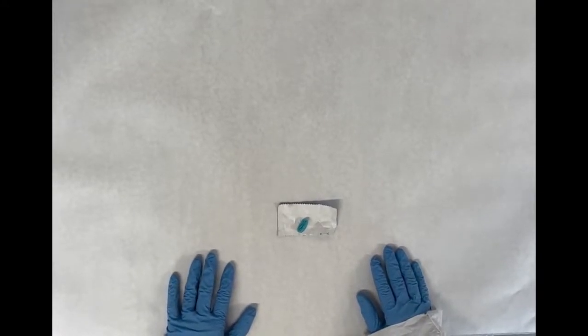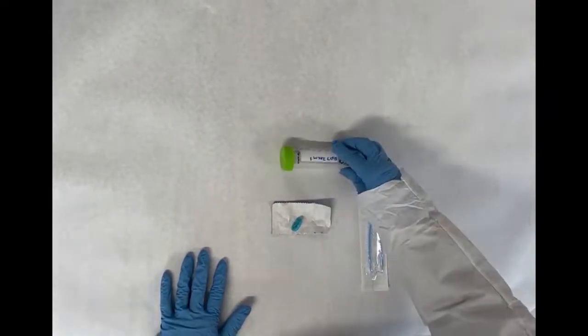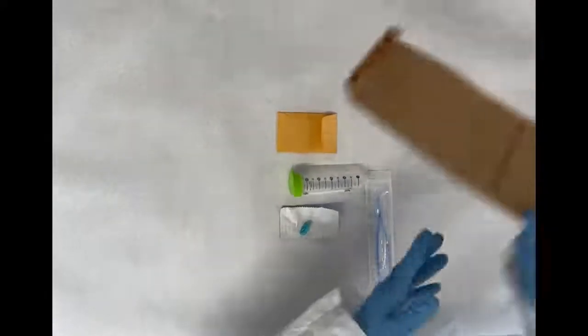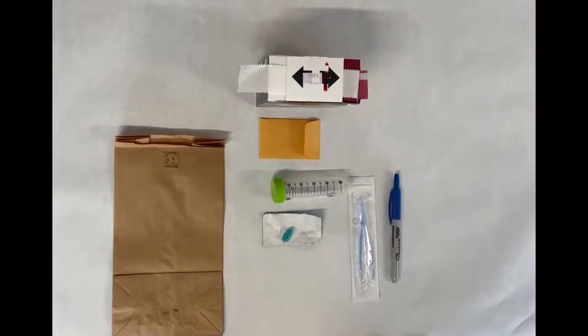The supplies you will need are gloves, sterile tweezers, a sterile tube, a small envelope, a paper evidence bag, evidence tape, a marker, and a freezer for storage.